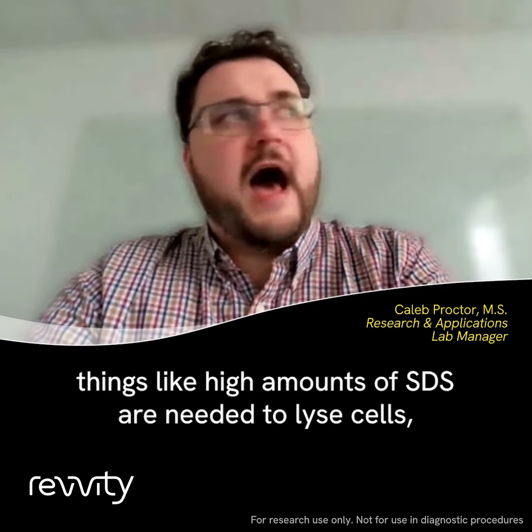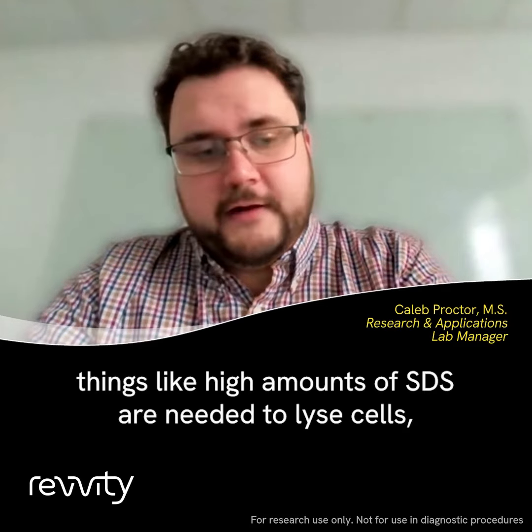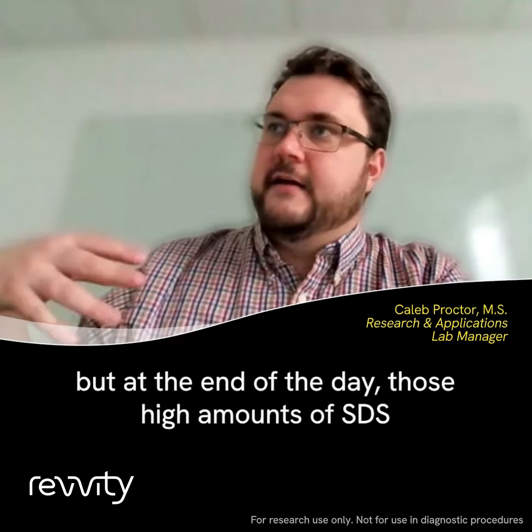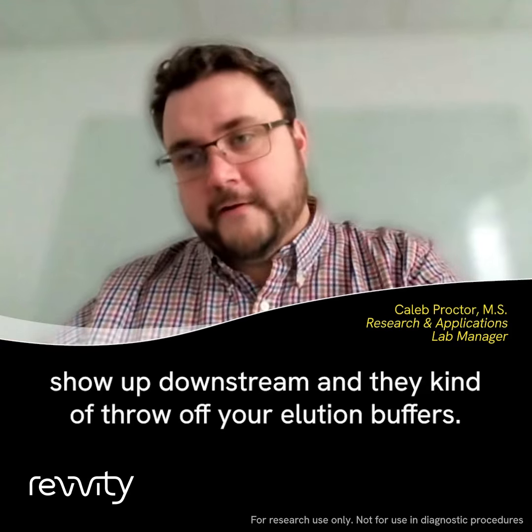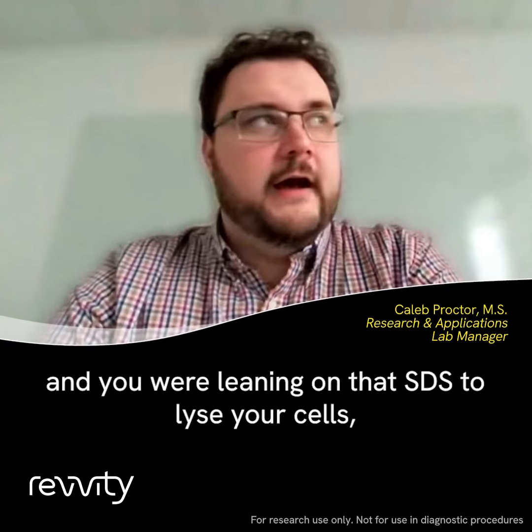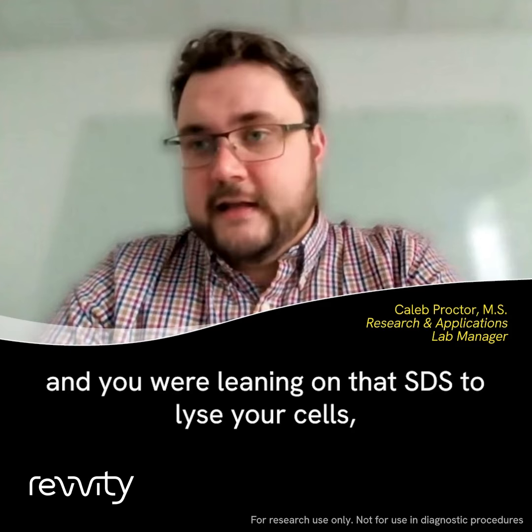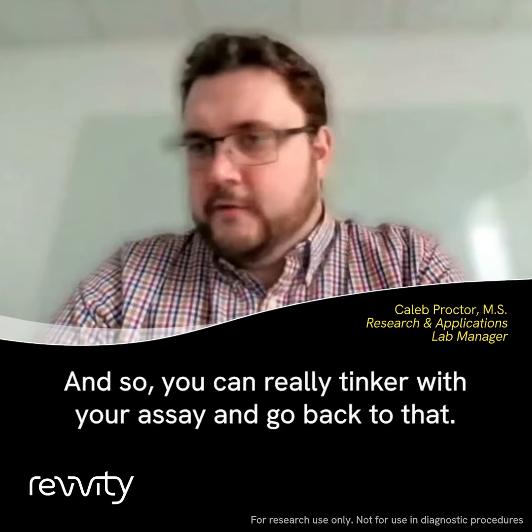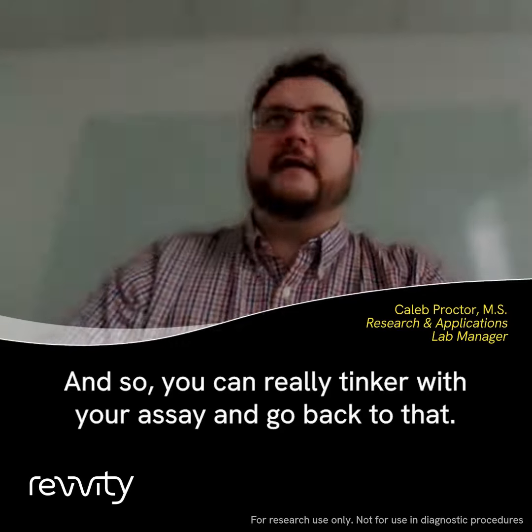Sometimes things like high amounts of SDS are needed to lyse cells, but at the end of the day, those high amounts of SDS show up downstream and they kind of throw off your elution buffers, right? If you're hand tailoring your chemistry and you were leaning on that SDS to lyse your cells, well, with physical lysis, you don't necessarily have that anymore. And so you can really tinker with your assay and go back to that.